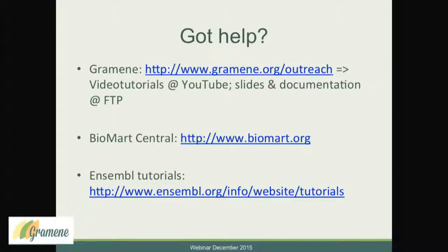For additional help, you can go to the Gramene Outreach websites where we have links for the video tutorials like this, and the Gramene YouTube channel. We also provide the slides and documentation in our FTP, and the links are in that same page. For BioMart specifically, I already mentioned it is a project on its own.